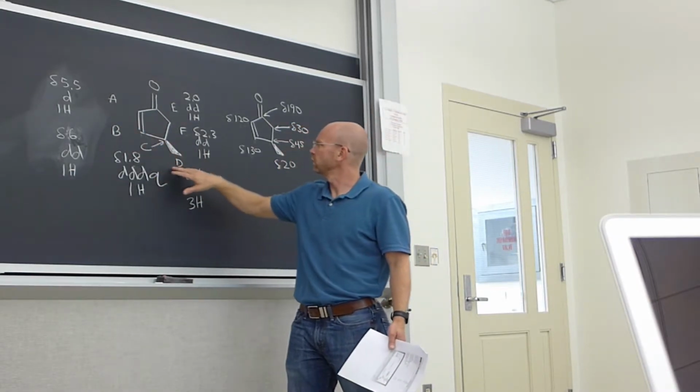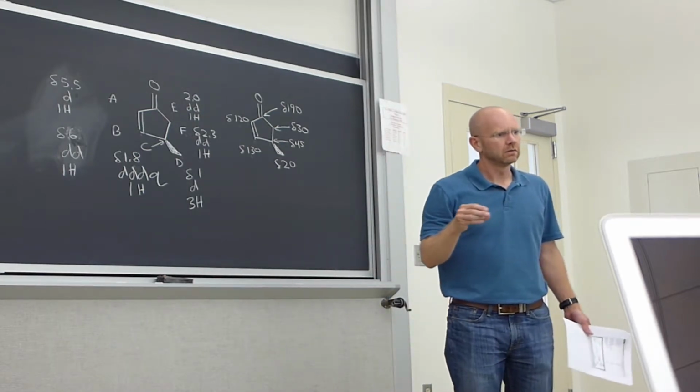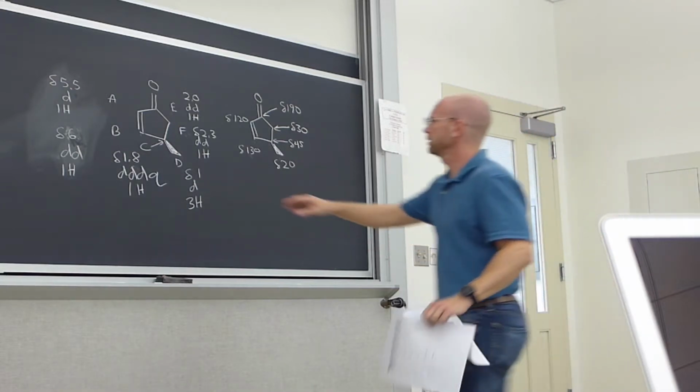1, 2, 3, 4, 5, 6. This is saying 5, or I need some values for 5. No, it has 3 and 2. So that's 1, 2, oh, 3, yeah, 4, 5, 6. So okay, it got 6. And what did it predict for this one?